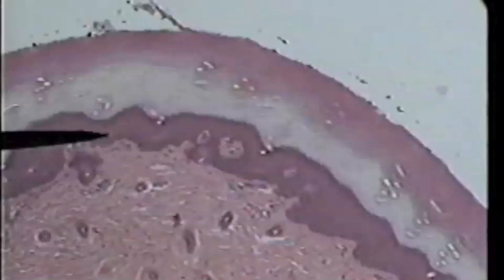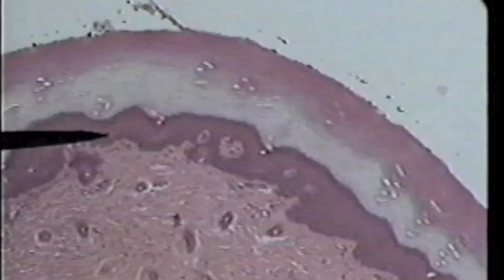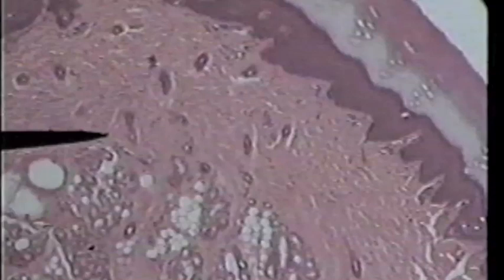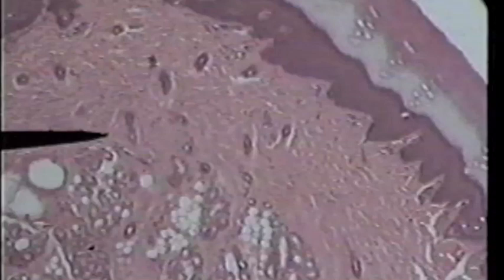The next connective tissue type we're interested in is adipose. To find adipose, we need to go back to the slide with thick skin, and that's what this slide is. Deep to that thick skin, we can see some white cells that give the appearance of cotton balls. Those cotton ball appearing cells are actually adipose tissue, found in the region below the pointer.